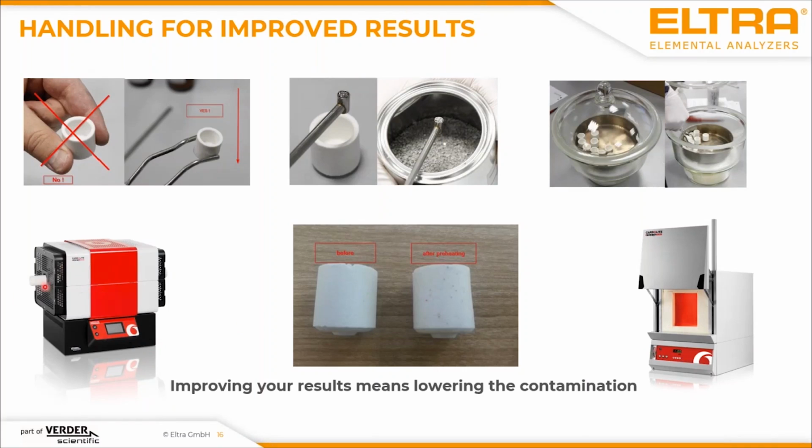This is a tube furnace. So you put in a crucible here, and every time you measure, you put in the next one, and it will come out here. Another possibility, not online to your analytical process, is that you take a muffle furnace, put in 50 crucibles, preheat them, and then later on you put them in an exsiccator where they are stored without touching the atmosphere again.